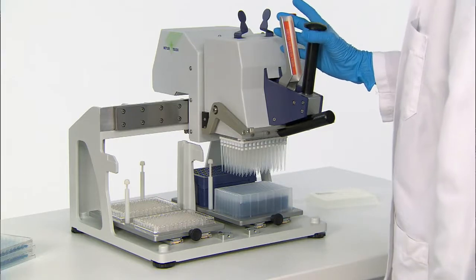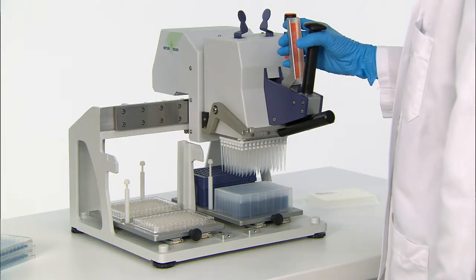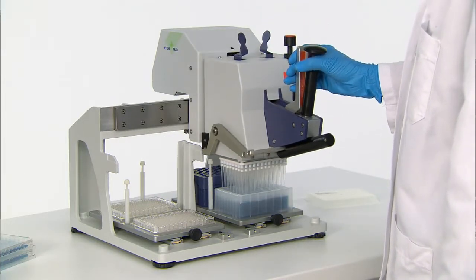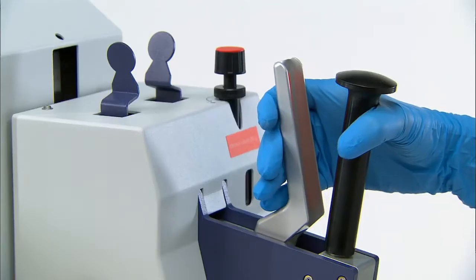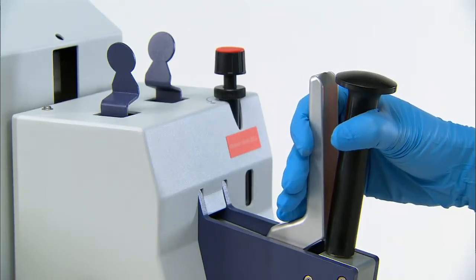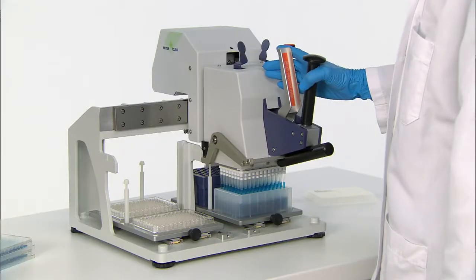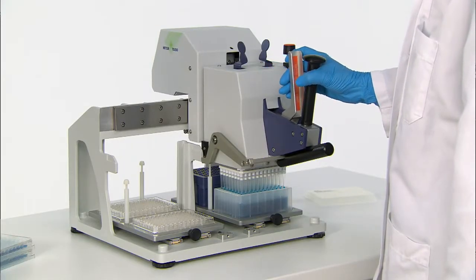Once the tips are loaded, slide the right platform back so that the tips are over the liquid sample. Squeeze the pipetting lever and lower the tips into the liquid. Slowly release and squeeze the handle twice in order to pre-rinse the inside of the tips for best accuracy and reproducibility.